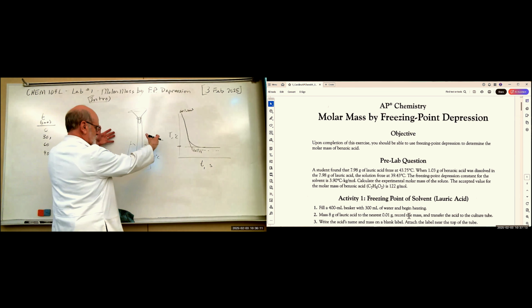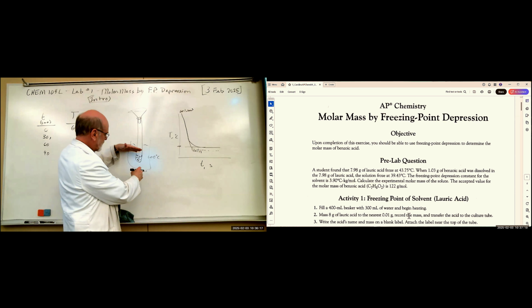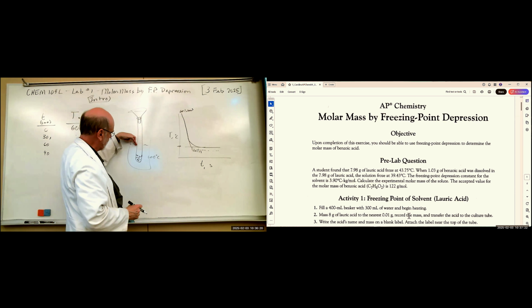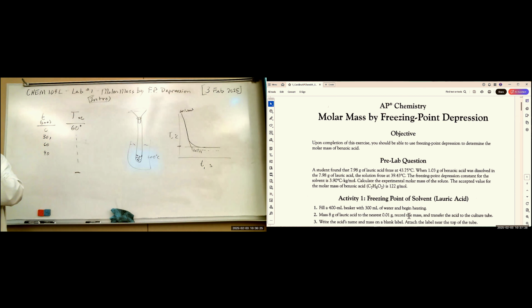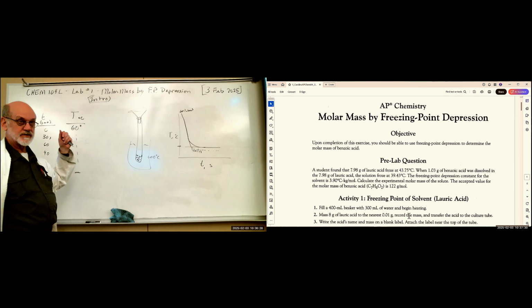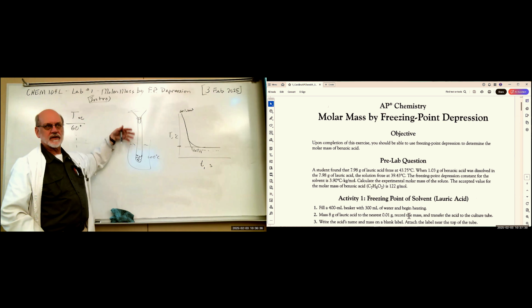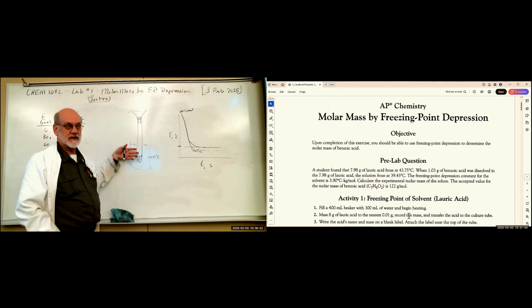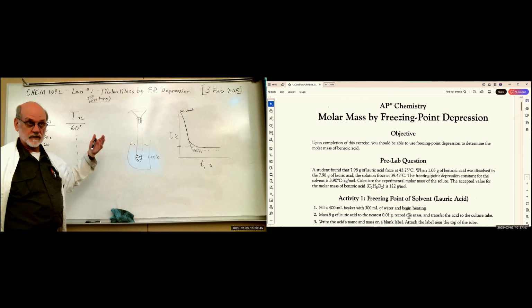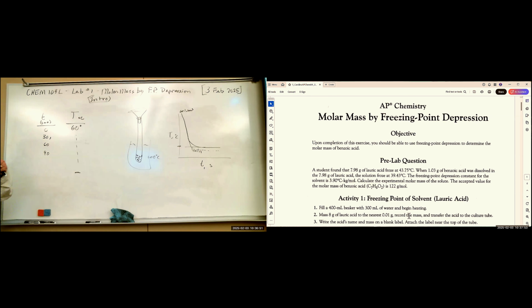And then we'll use maybe a liter water bath, so you can get it way down in here deep. If anything is on the sides here, maybe it'll melt and flow down into the bottom. Try to minimize that error, because the concentration is everything. When you do the pure solvent, it doesn't matter how much gets in the bottom, because there's no change in concentration. But when you do the solution, if you have any left up here, that's going to influence the concentration, and that will change the temperature.